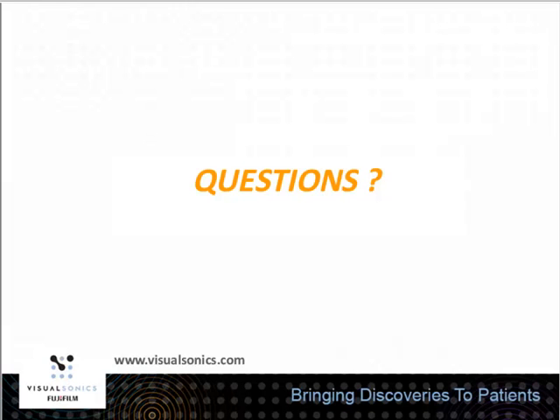The very last question is with respect to application. We had a question whether CSF can be visualized in the choroid plexus. We're talking about the brain, and this comes from the aspect of using photoacoustics. While I don't have enough information, I'm assuming it's in the embryonic stage. This can be done, but before I say something, I'd like to bring our neurobiologist, a specialist in this field, to your attention, and we will address that offline.